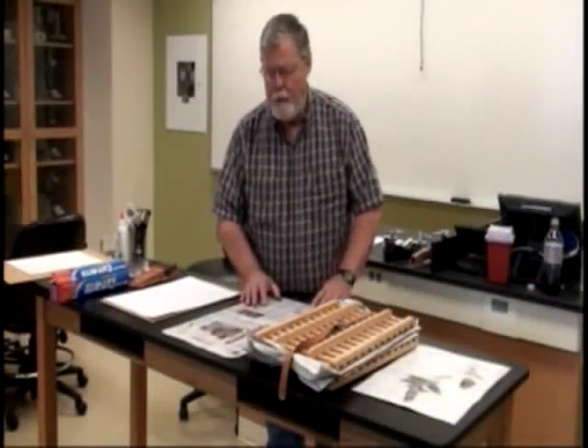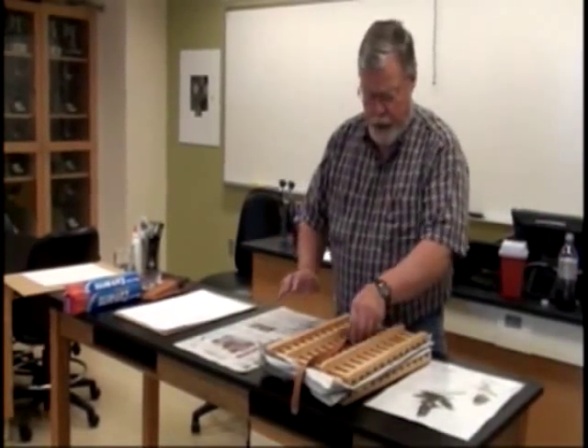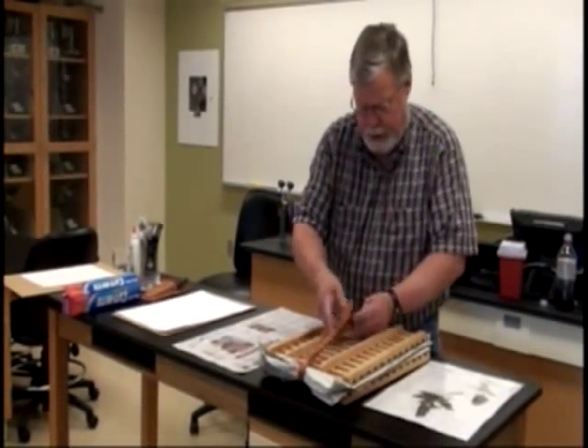Today we're going to do a presentation on making herbarium mounts. We're going to use a plant that we pressed in a previous presentation.